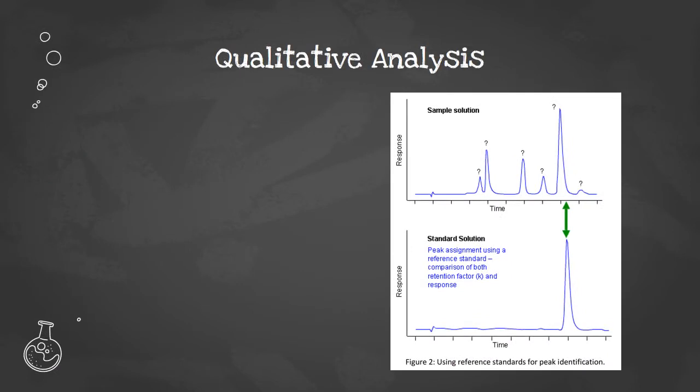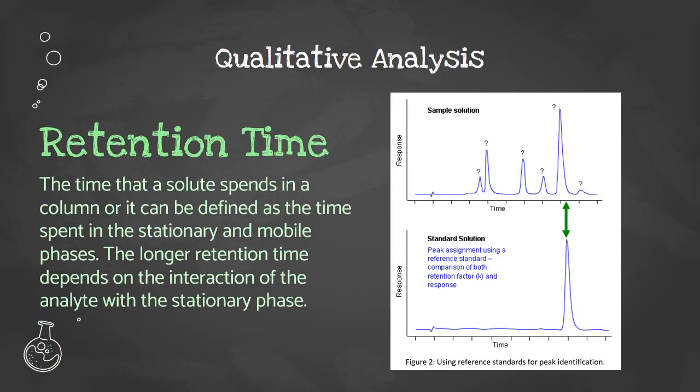In theory, GC retention times should be useful for identifying components in mixtures. Although a chromatogram may not lead to positive identification of the species in a sample, it often provides sure evidence of the absence of species. Thus, failure of a sample to produce a peak at the same retention time as a standard obtained under identical conditions is strong evidence that the compound in question is absent.